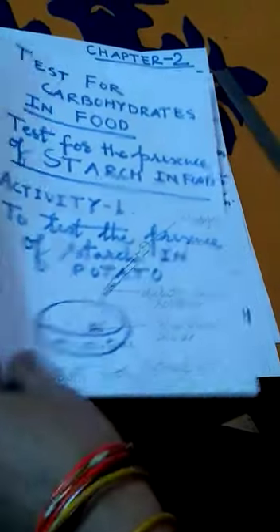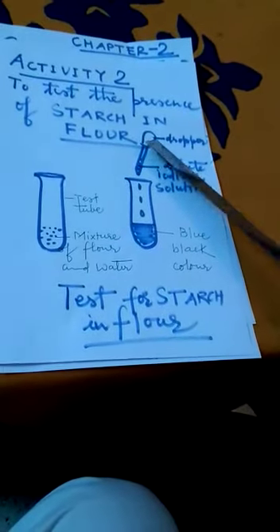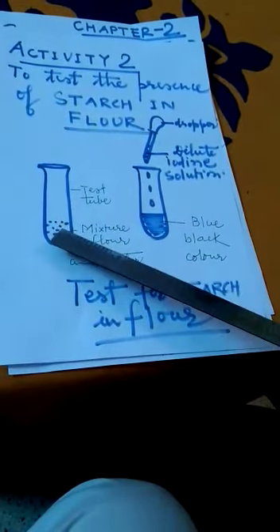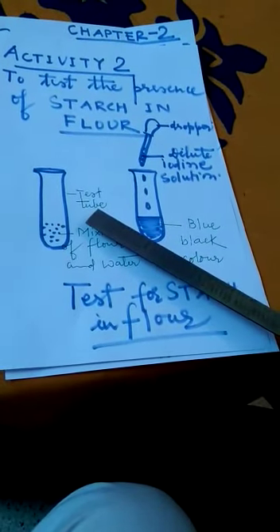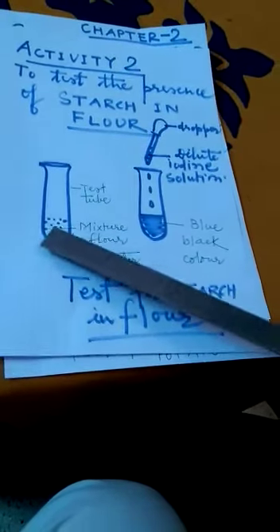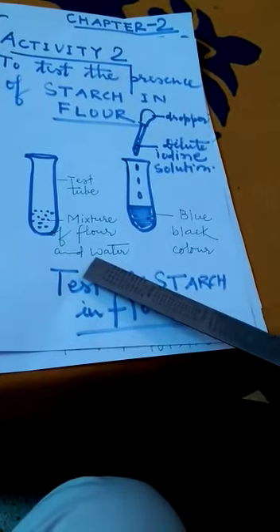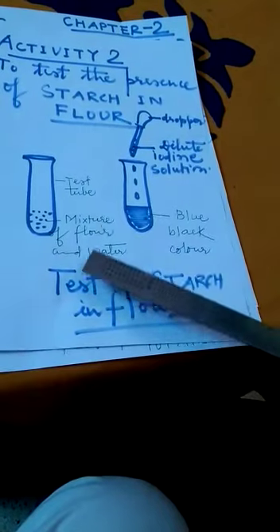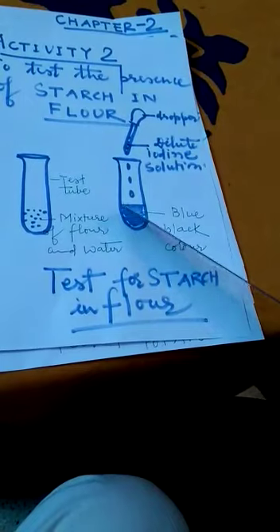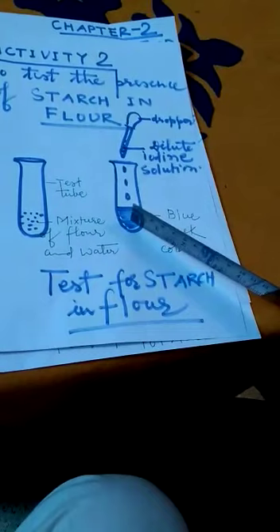So, another activity to test the presence of starch: take a small quantity of flour in a test tube and shake it with a little water. In the first test tube, we have taken the mixture of flour and water, and we have added 2 or 3 drops of dilute iodine solution to the mixture of flour and water.